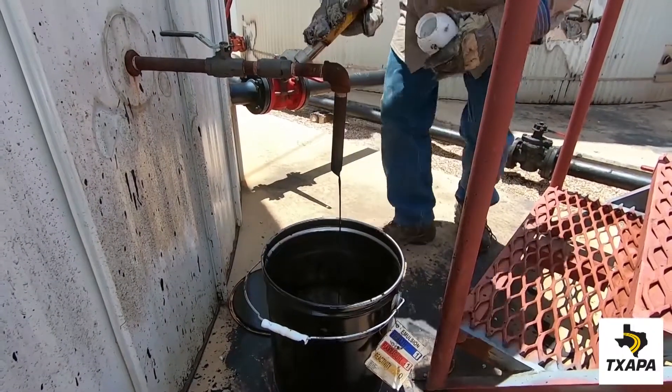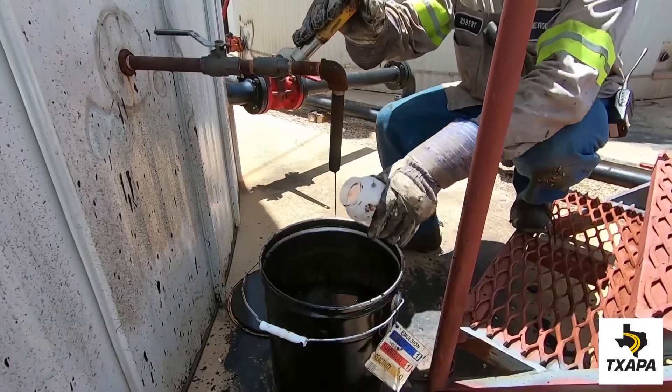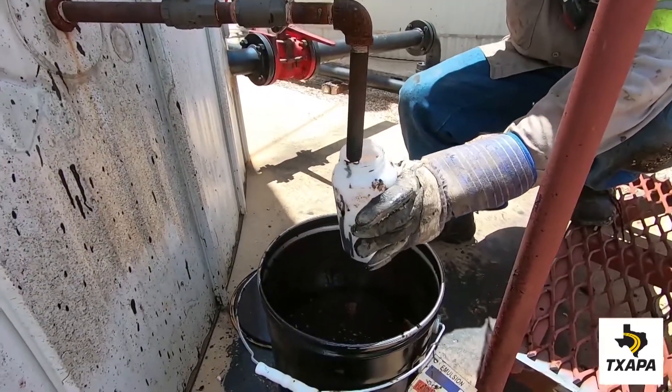Once the line is purged, the valve is closed, and the clean sample container is placed underneath the valve, and the valve reopens slowly.